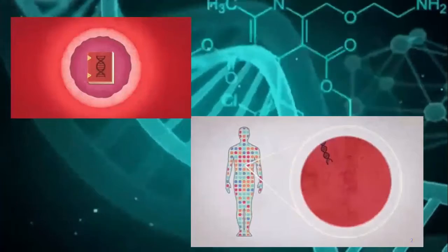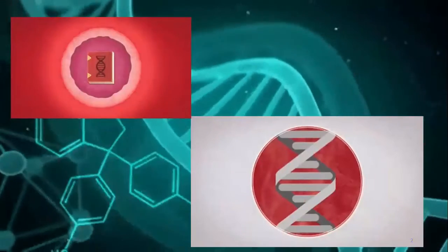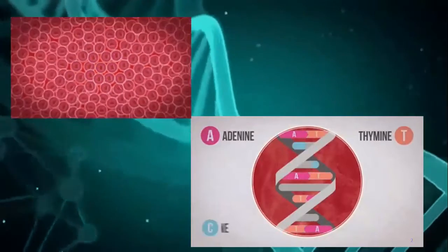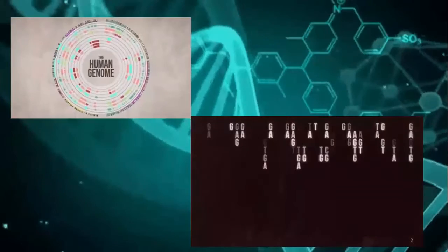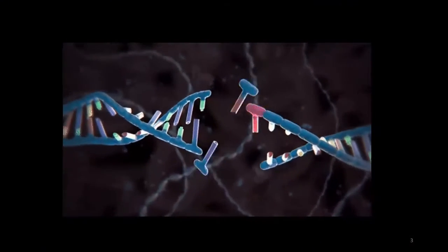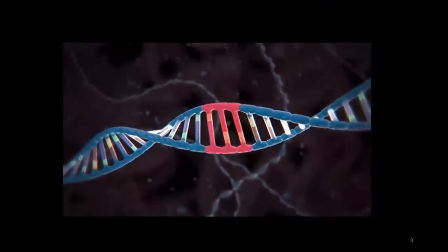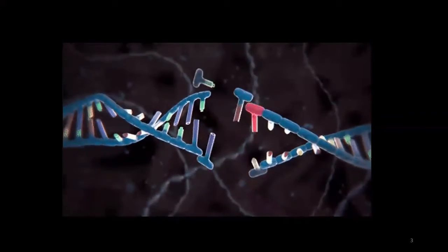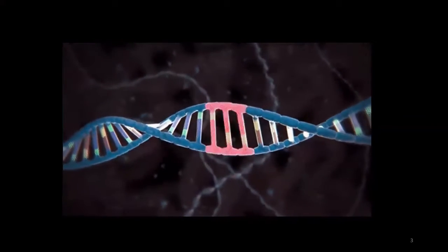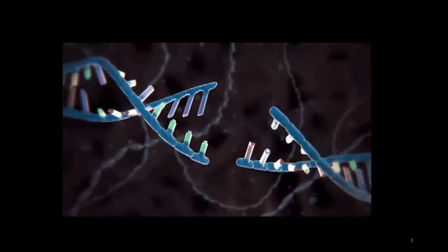Knowledge of DNA sequences enables a greater understanding of the molecular basis of life, providing several pieces of information on a wide range of biological processes. Information on DNA sequences and the ability to manipulate these has accelerated the development of biotechnology and has led to the development of molecular techniques that provide the tools for asking and answering several important scientific questions.